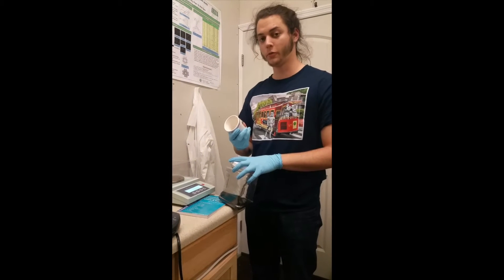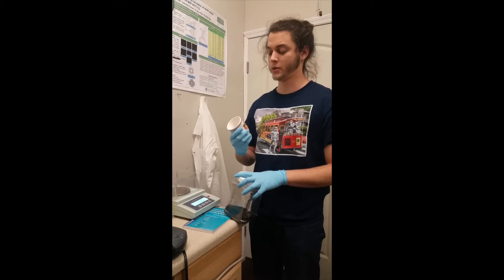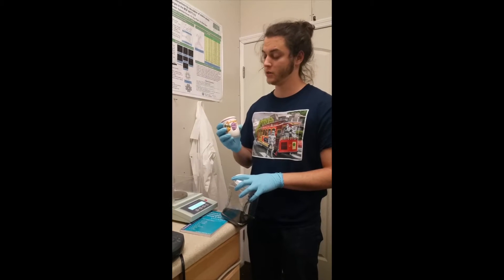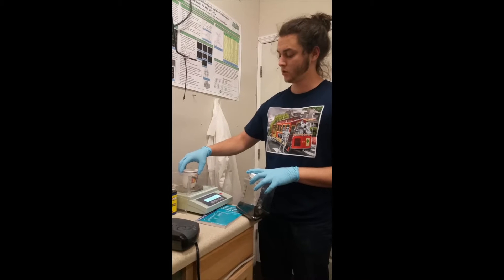I've done this before with a glass container and it broke it, but I'm going to try ceramic this time with these nice little grapes and hopefully it won't break it. But if it does, that would be sad because it's a nice little jar thing.